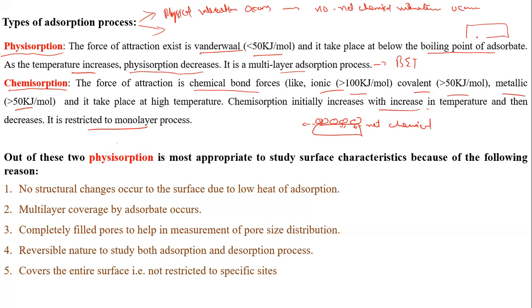However, in case of physisorption, many multi-layers, for example this kind of adsorption, can take place. That means there is no net chemical interaction between the solid surface and the gaseous molecules.